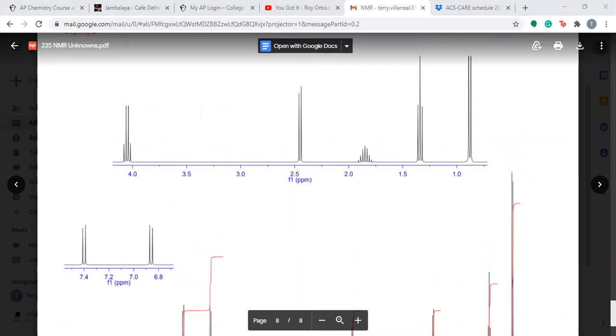Okay, so Morgan, my isopropyl group is this here and this here, right? Yes. So that is a CH connected to a CH3 connected to a CH3 like this, right? We saw here that this was a nonet. It has 9 peaks. So how many neighbors does it have? 8. So I have 3, 6. So then this has to be connected to a CH2, correct? Yeah. All right. At this point, you may say to yourself, well, I know that this has an integration of 2. This is an integration of 2. This is an integration of 1. This is 3, and this is 6.